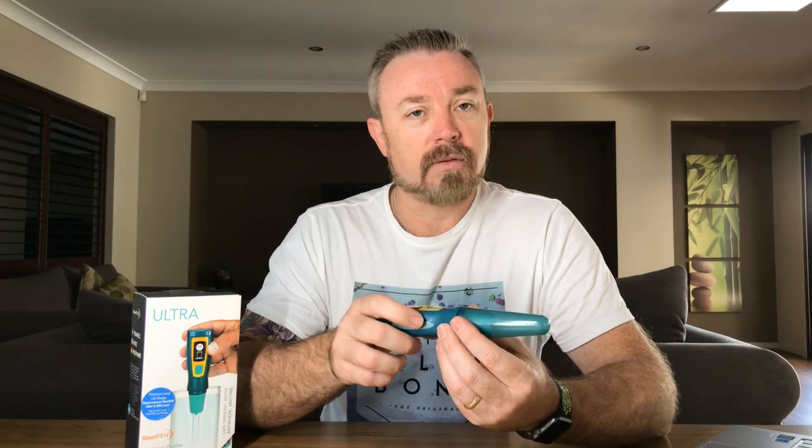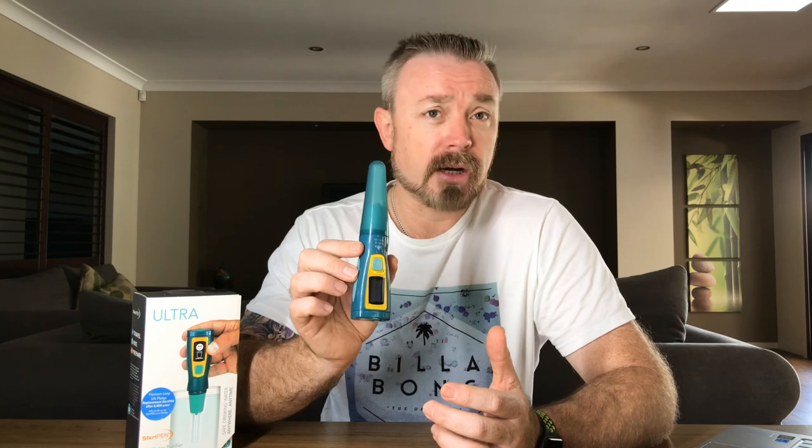After that little test, I can definitely say that the SteriPen Ultra does work — it dramatically reduced the amount of E. coli that grew in the treated water compared to the untreated. Hopefully when we take this little device on our Asian trip, it'll look after us and keep us nice and healthy. Until next time.